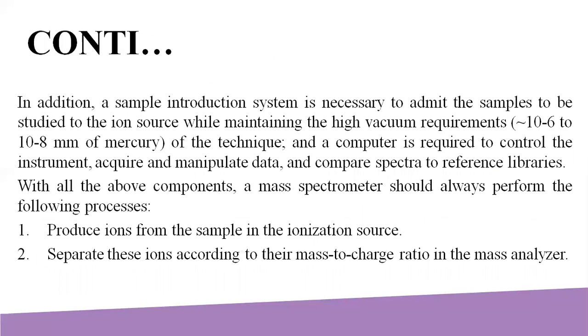In addition, a sample introduction system is necessary to admit the sample to be studied to the ion source while maintaining the high vacuum requirements, that is 10^-6 to 10^-8 millimeter of mercury, of the technique. And a computer is required to control the instrument, acquire and manipulate data, and compare spectra to reference libraries.